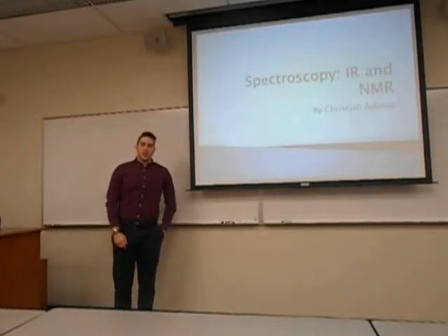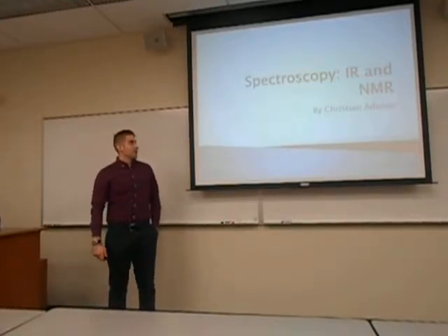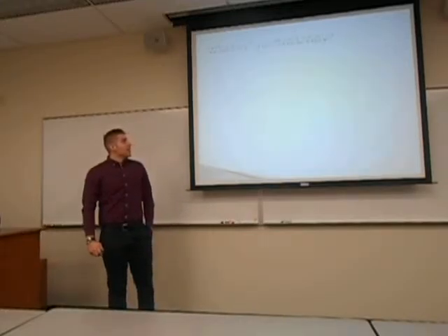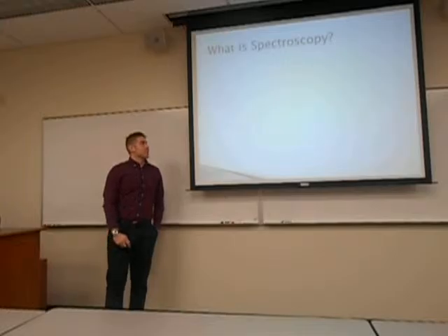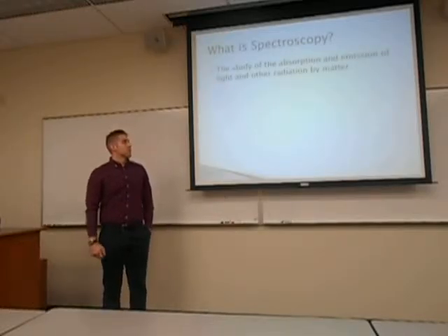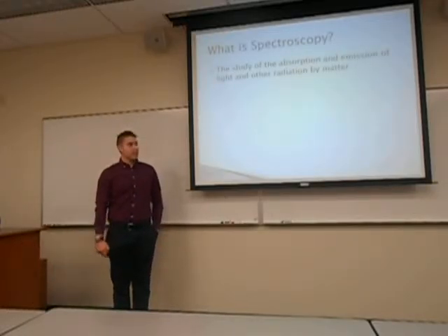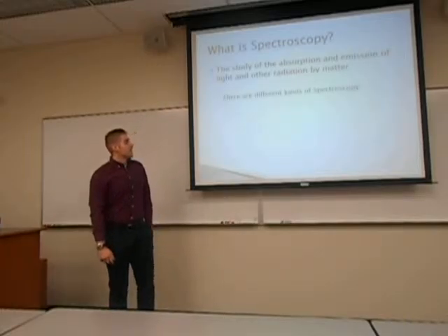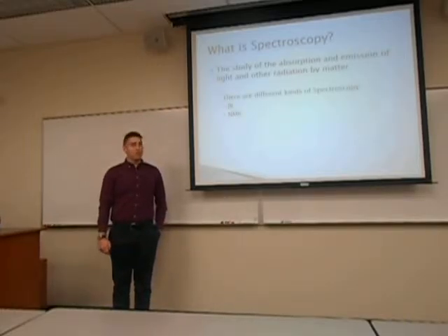My name is Christian Adamo, and I'm here to talk about our experiment on spectroscopy using IR and NMR. So first, what is spectroscopy? It is a study of the absorption and emission of light and other radiation by matter. And for this experiment we use two forms, and that is IR and NMR.